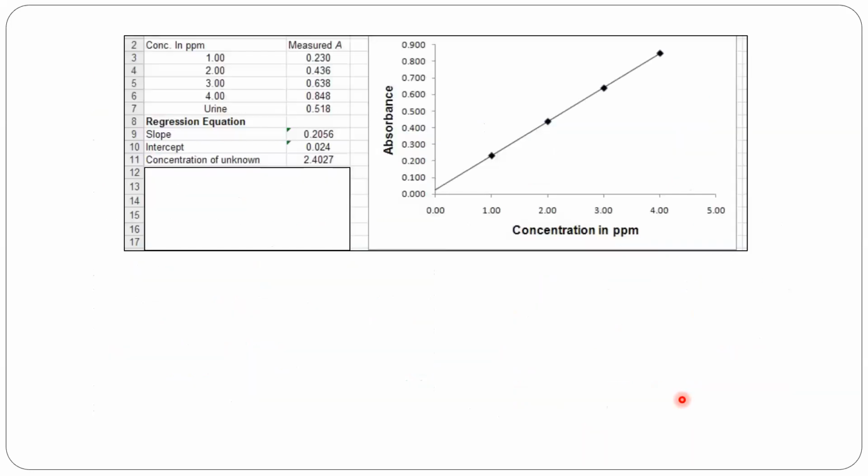Okay? So what you will do is take your Excel and plot yung 1, 2, 3, 4 versus the measured absorbance. Okay? So if you want, while you are viewing this video, you can open your Excel and try to plot it and see if you will get the same curve, meaning that linear. Okay? So yung 1, 2, 3, 4, yung ppm concentration, x-axis yan. And yung signal, which is in this case absorbance, y-axis. So the best practice lagi is that yung signal, whatever that signal is, absorbance, emitted radiation, intensity, potential, pH, lagi siyang y-axis. Yung concentration mo laging x-axis.